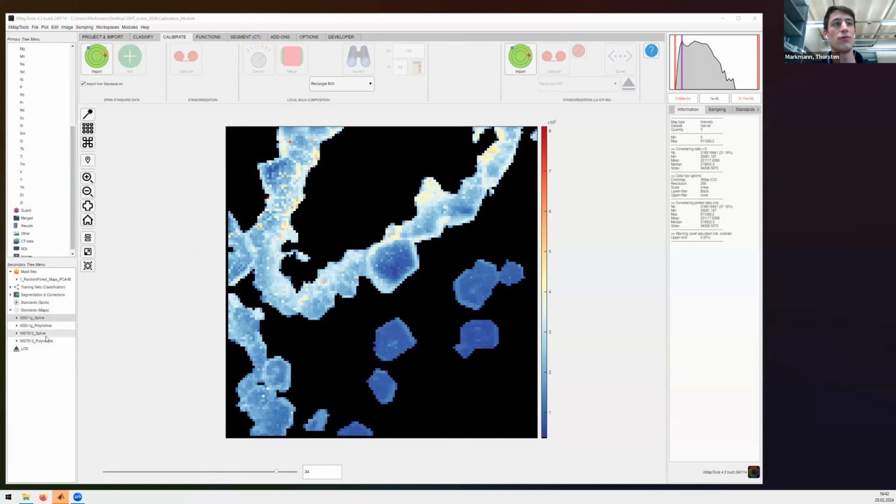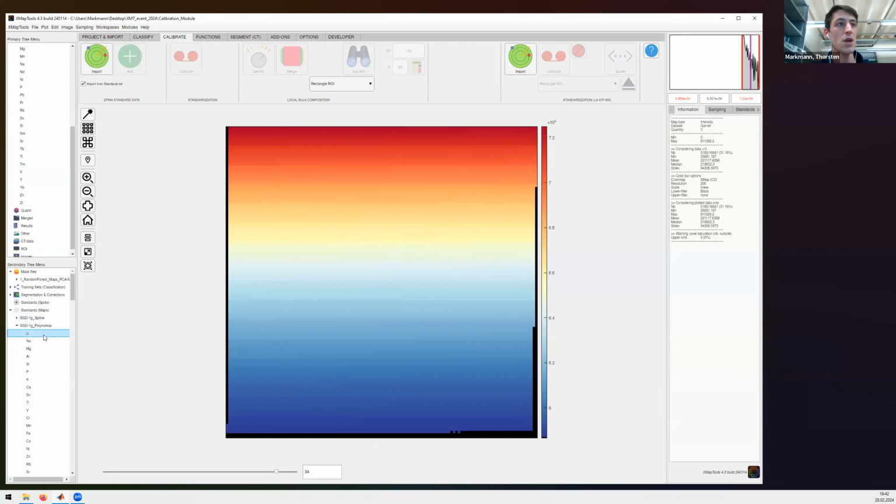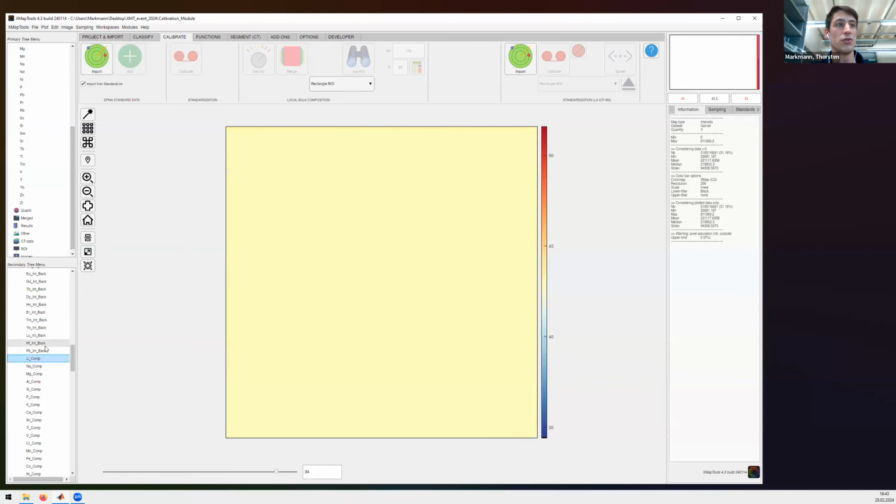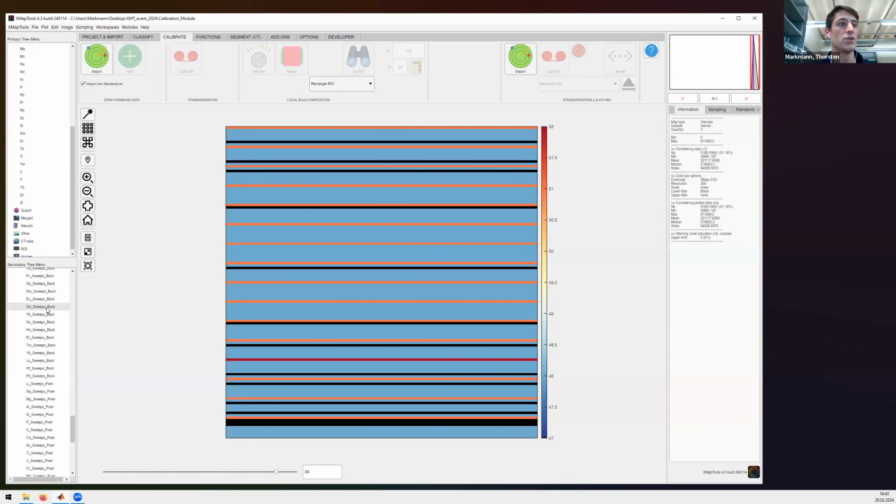Now we see all the 4 primary standards we saved earlier. For example, for the GSD1G polynomial, we can investigate the intensity map, and we see this trend of the polynomial we know from earlier. It also saves the background information of the sample, the composition of this reference material, which is the published value in this case, and information on the sweeps which have been acquired and the pixels. But this is not what we want to do now.